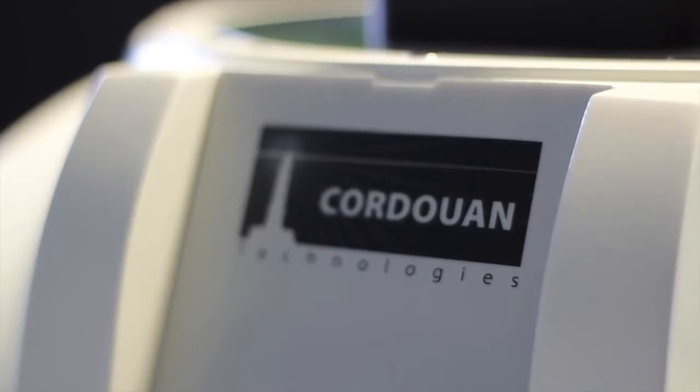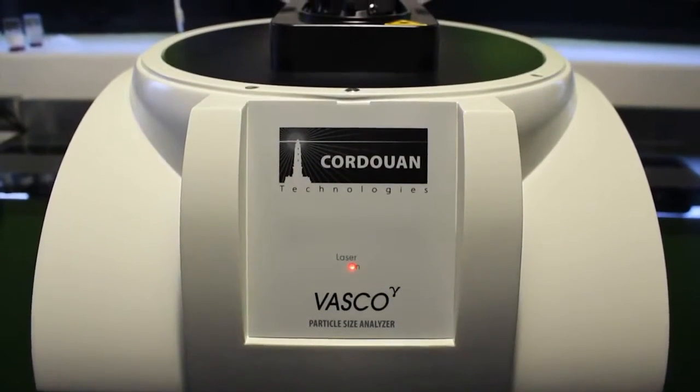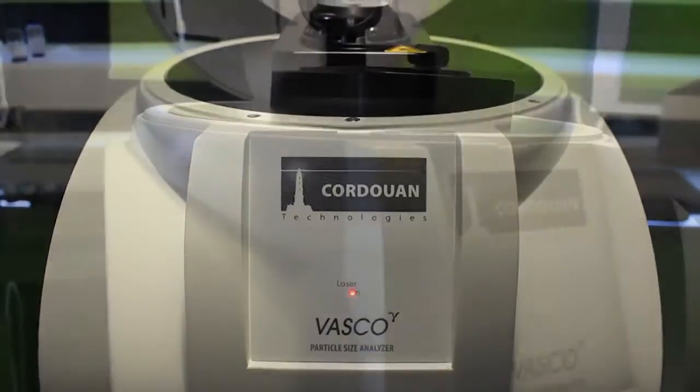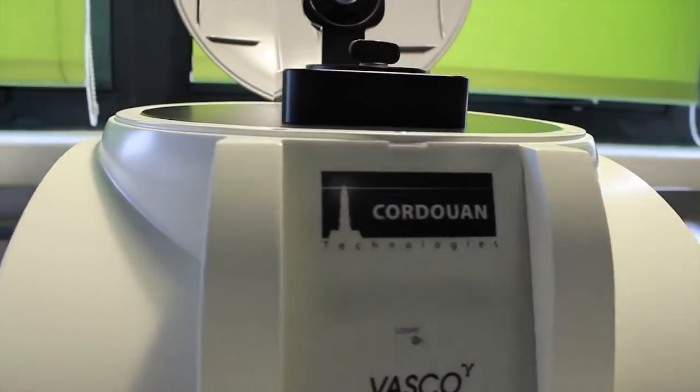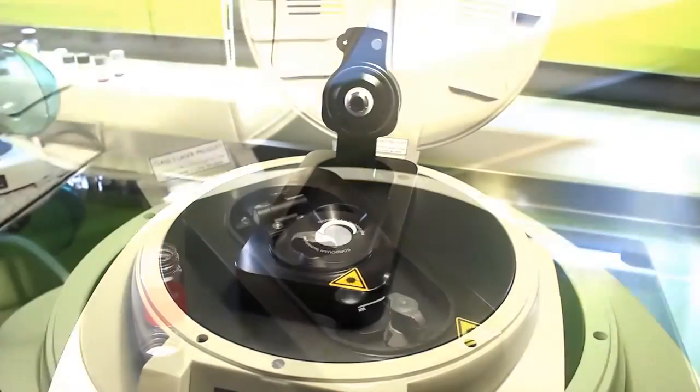Cordouan Technologies is pleased to introduce its range of Vasco Particle Size Analyzers. Vasco Particle Size Analyzers are dedicated to the measurement of nanoparticle size in the range of 1 nanometer to 10 microns by the well-known technique Dynamic Light Scattering.